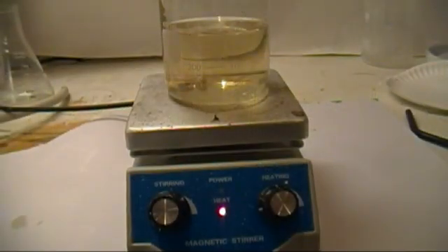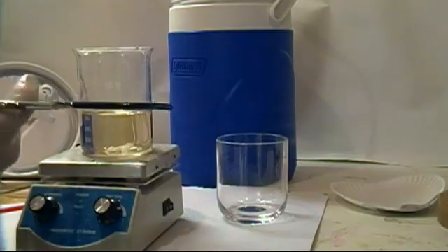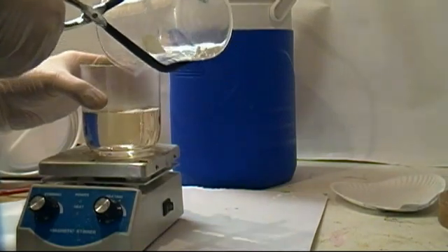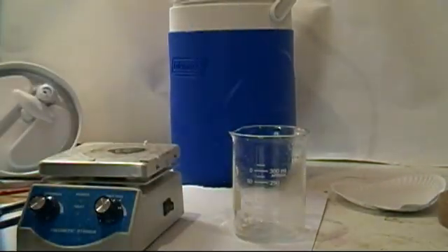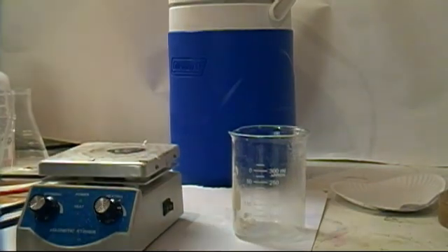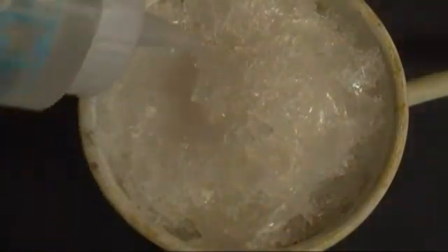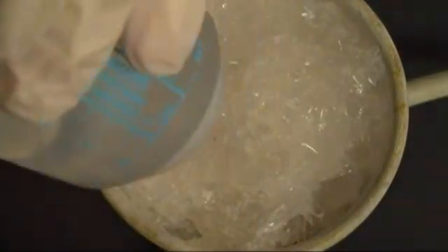Now we need to concentrate the sodium acetate by boiling away the water on a hot plate. Boil until you start to see very small crystals forming on the surface, then remove from heat and pour the mixture into a clean beaker. Place that beaker into a large thermos and add the lid — this will allow the solution to cool slowly and help form larger crystals, giving a purer product. After a couple of hours, remove the beaker from the thermos and pour the crystals into a vacuum filtration system. Wash the crystals with cold 91% isopropyl alcohol, then set them aside to dry.